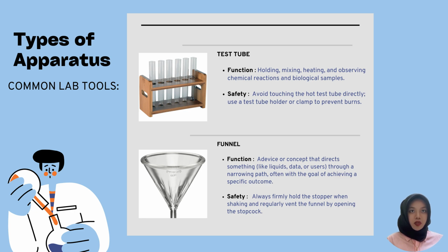Last but not least, for the common lab tools is the funnel. Its function is a device or concept that directs something like liquids, data, or users through a narrowing path, often with the goal of achieving a specific outcome. For the safety, always firmly hold the stopper when shaking and regularly vent the funnel by opening the stopcock.